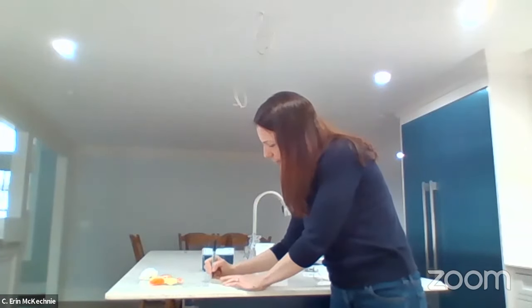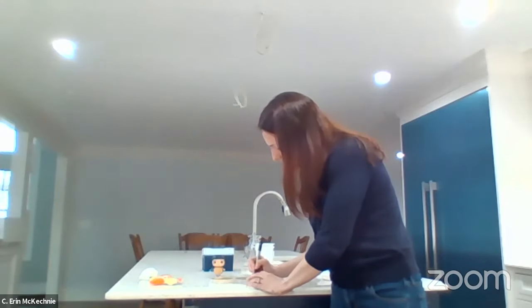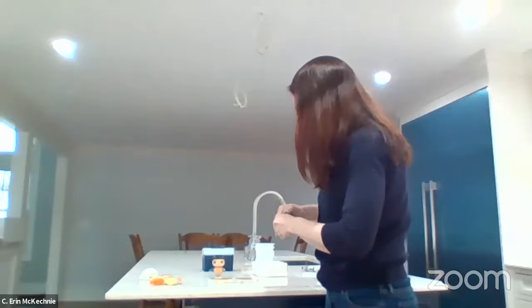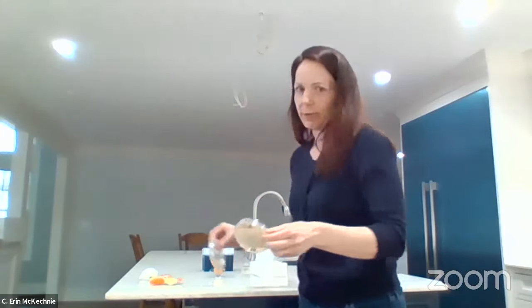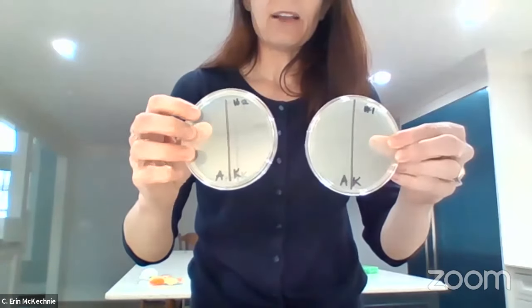I'm going to label one of the dishes number 1, one of the dishes number 2, and I'm going to put an A on the bottom and a K on the bottom. So this is just some prep work that I'm doing to keep everything straightforward. Show you how I labeled them. Just like that. So this is my number 1 plate. This is my number 2 plate. And if you see, they have an A on the bottom and a K.